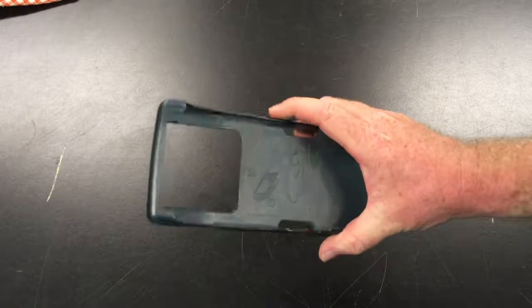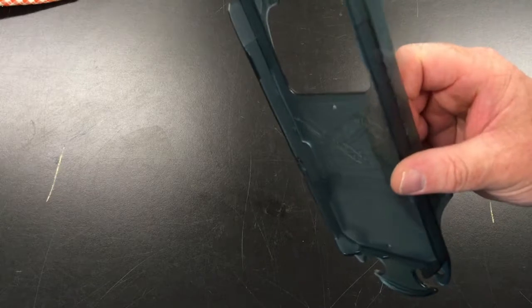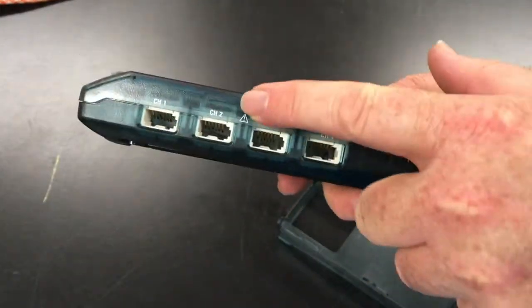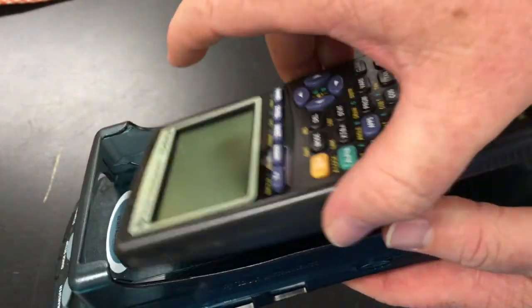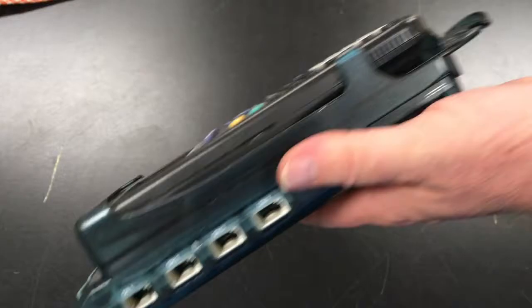We have a cradle, and there's little pictures on there showing how to do it, but basically this side has rails and the other side has claws for grabbing things. So the rail side will go into these slots on the side of the data logger, like so, from the bottom of the data logger to the top. The calculator goes in the side with the claws, and that's held together. And then you need to connect the two, the data logger and the computer.